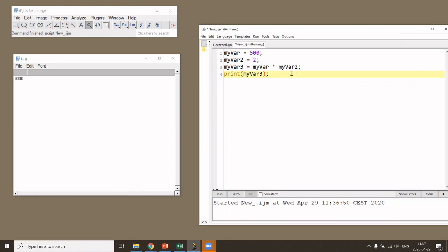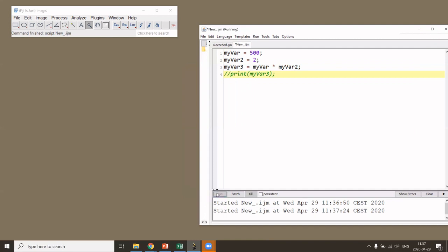An important concept is comments. You can comment out code with two forward slashes — everything after them will not be executed. If you comment out the print command, the variables are still created and filled with values, but nothing is printed. The color of commented-out text changes to green, which is called color coding. Comments are very useful for documenting what your code is doing.